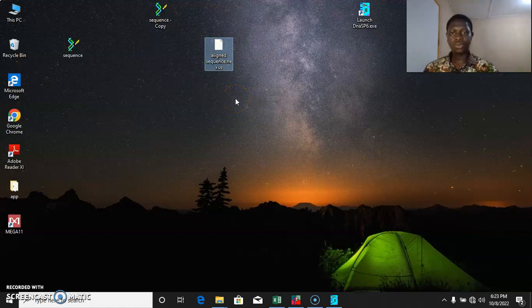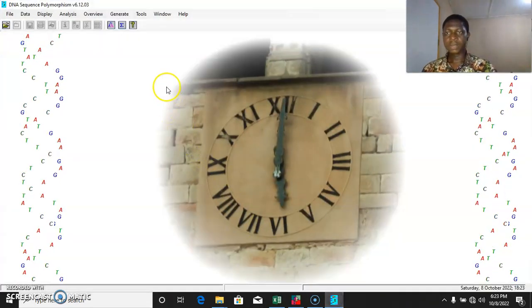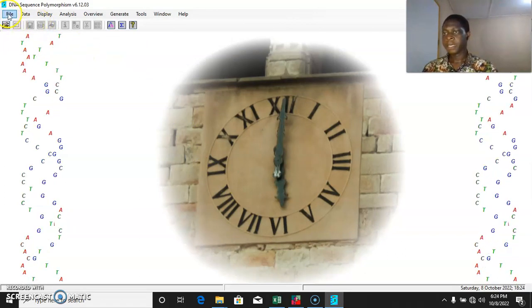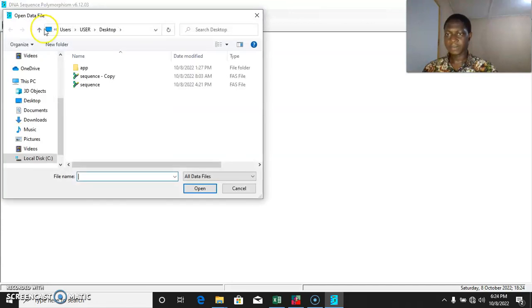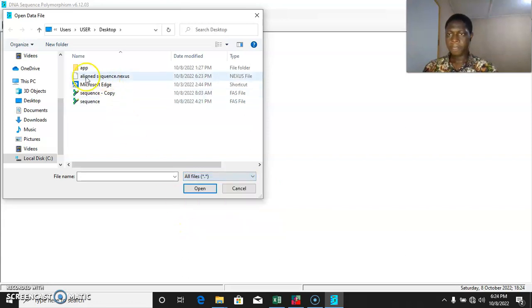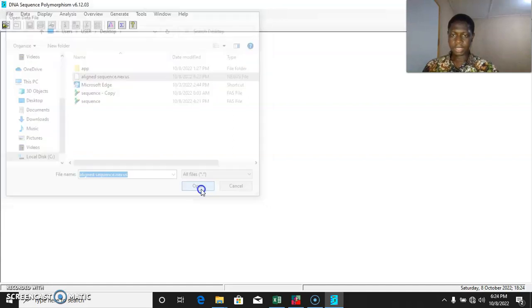The next thing we want to do is to build the haplotype data file. To do that, we use the DNA Sequencing Polymorphism software. The link to downloading the software will be provided as a caption. So we select File, then open data file. We come to all data files, select all files, then we select 'aligned sequence.nexus'. Once you select that, you open the file.